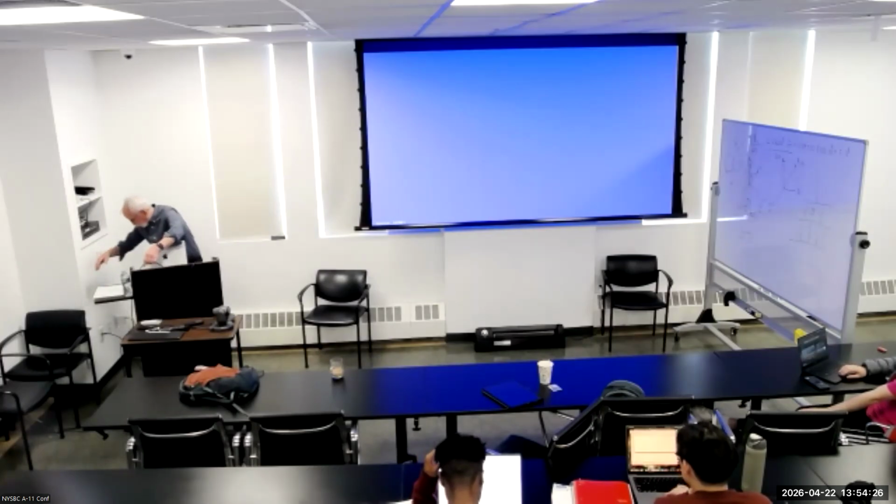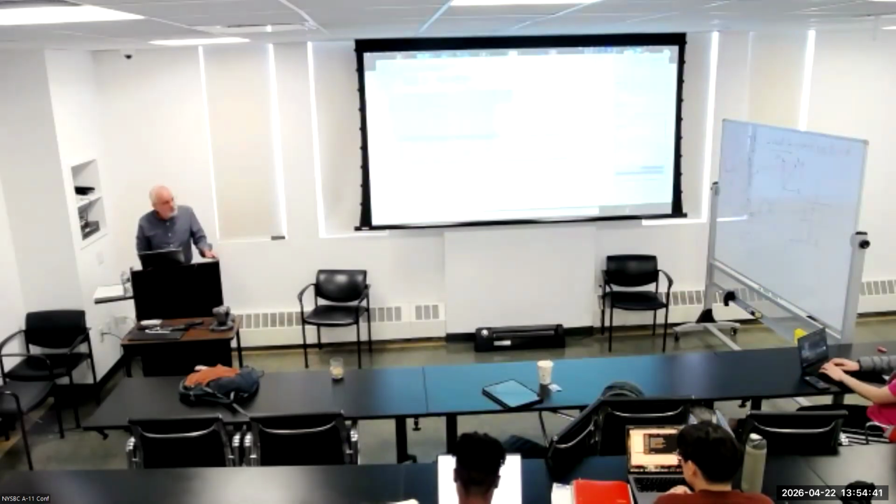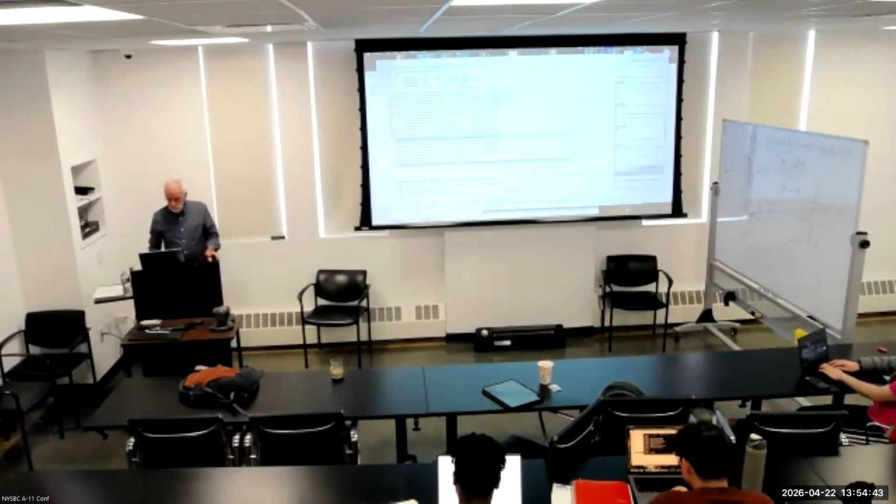So, while Bruce worries about getting connected, are there any questions online? No problem. What do you do about aliphatic decoupling in the carbon experiments?